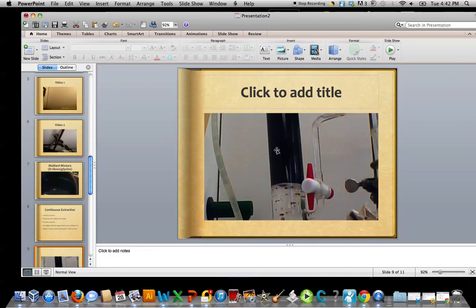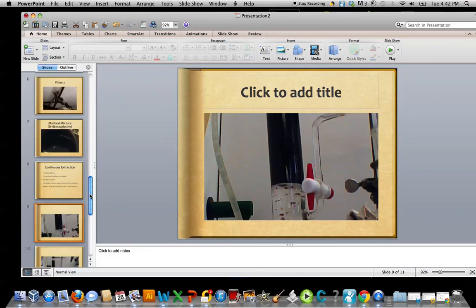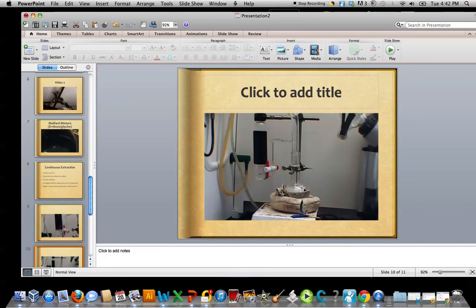Here's the continuous extractor. You see the upper layer — that's your aqueous solution of the Maillard mixture. And down here is the methylene chloride, which will be heated to reflux; it'll boil. I have a condenser on top of this. Then we see what we pull into the round-bottom flask — this is where we heat. Methylene chloride will volatilize up, condense, run through the solution, and pull out over 24 to 48 hours any components that are soluble even to the parts-per-million level. Upon cooling, they'll either crash out of the methylene chloride, or I'll evaporate it and try to determine the structure — or structures — of what was extracted.